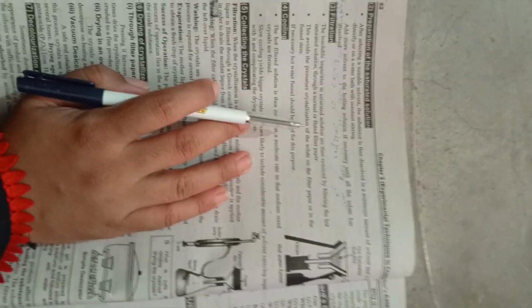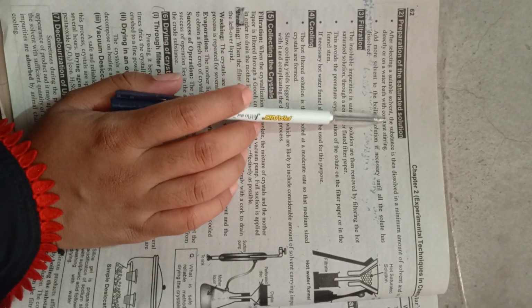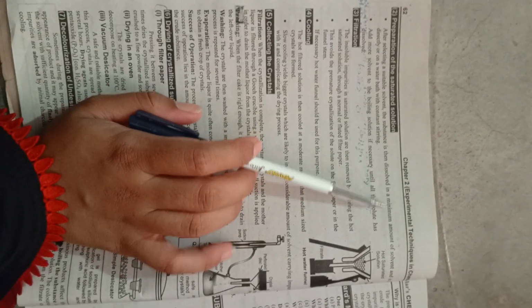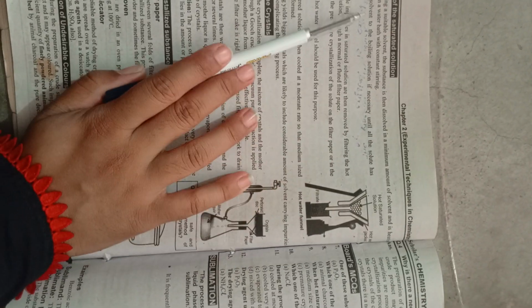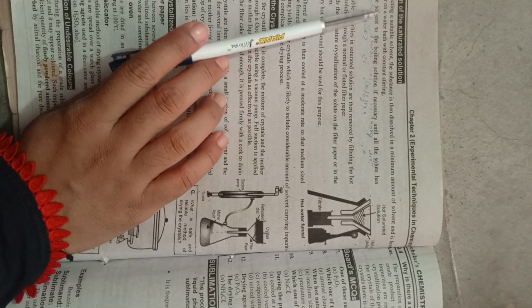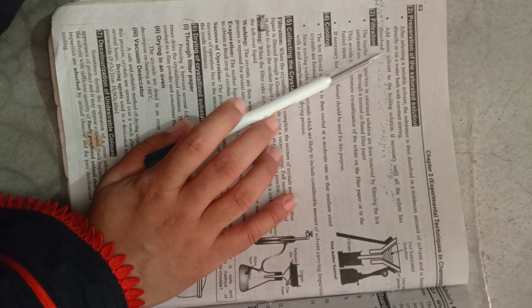आगे है हमारे पास preparation of saturated solution. After selecting a suitable solvent, the substance is then dissolved in a minimum amount of solvent and then heated directly or on a water bath with constant stirring. Add more solvent to the boiling solution if necessary until the solute has dissolved.